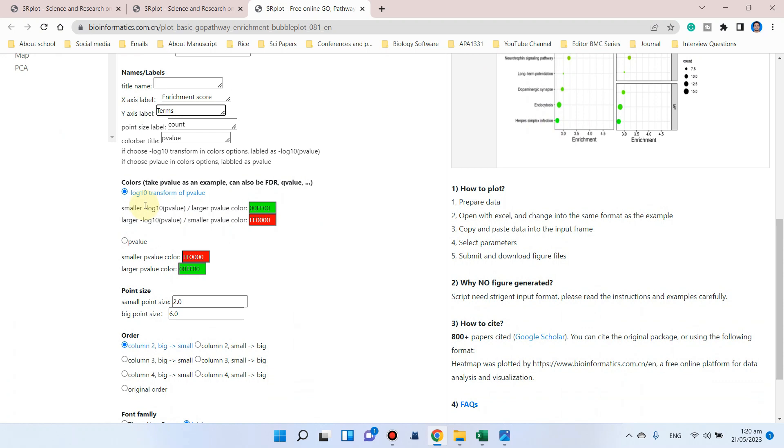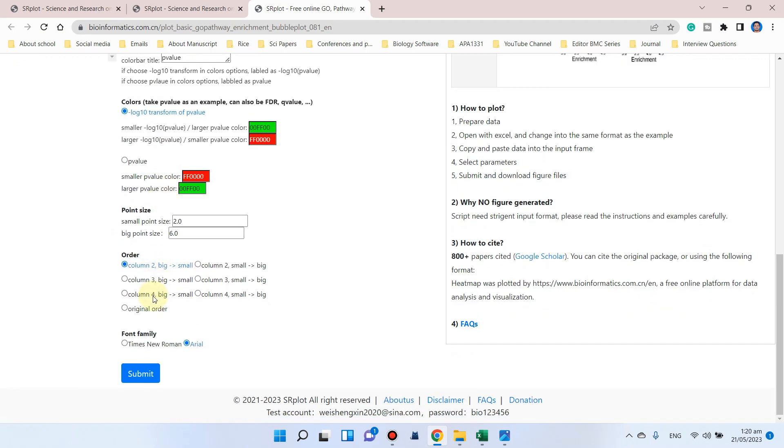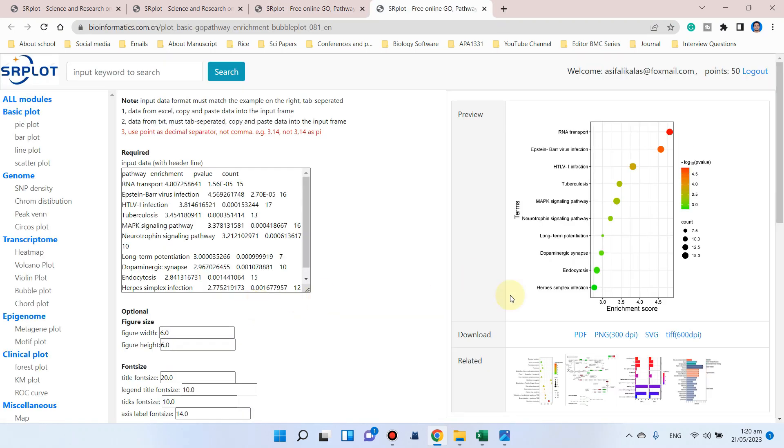Now we can also show the color with the help of negative log 10 p-values. I will prefer negative log of 10, so we can simply click on this submit button. It will generate a beautiful KEGG pathway for us.